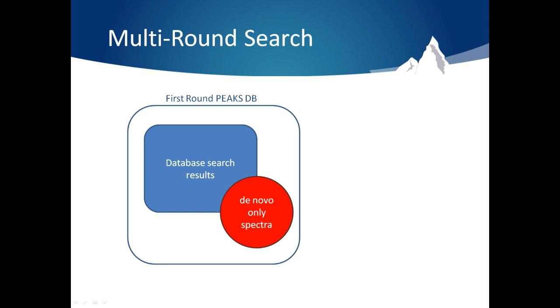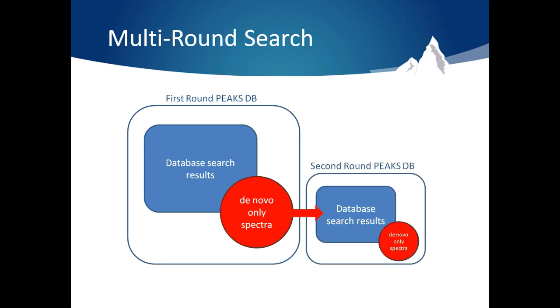Multi-Round Search takes the de novo only spectra and separates them from the scans already matched using the database search algorithm. It allows you to search just those spectra with different parameters. So you can choose a new database, different PTMs, different enzyme cleavage rules. The possibilities are endless.